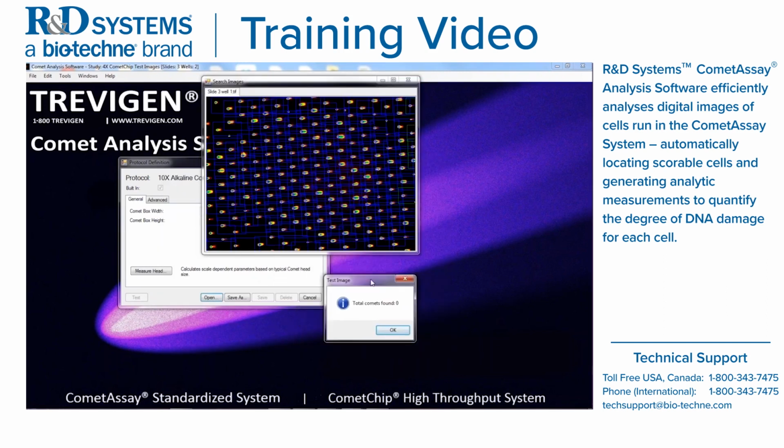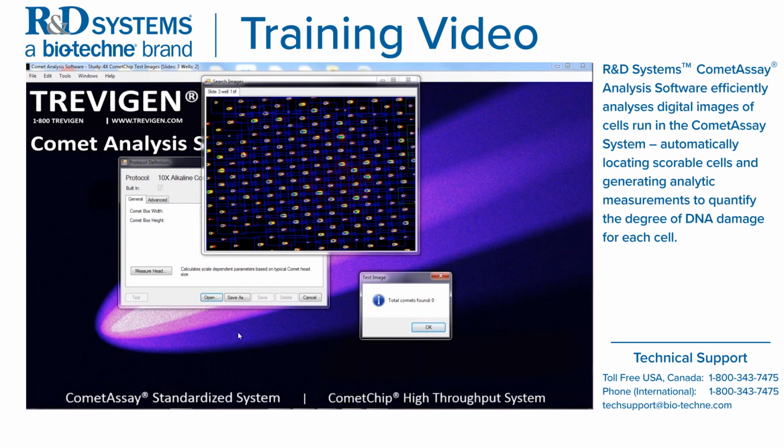Wow. Now you're not seeing white boxes around these comets. What you're seeing is a lot of overlapping blue. So this protocol that was used didn't work, all right? And sometimes maybe you got even 50% of the comets being called in your image, but you'd like much more. So this is an indication that you need to develop a new protocol. You need to create a new protocol. So how are we going to do it?